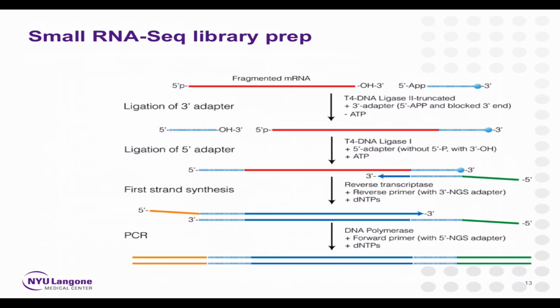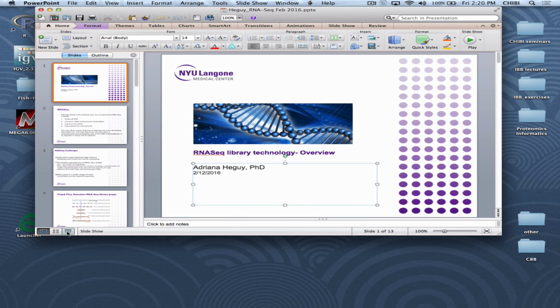You are making your miRNA longer than it should be by these extra adapters, and then you build another library. It's quite more complicated and quite more expensive, but it's also doable, and it also requires very specific bioinformatics. That's basically all I have to say.